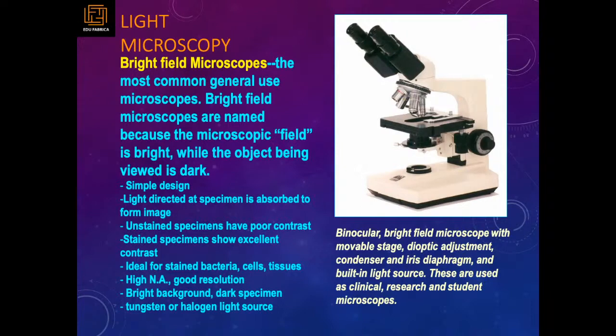So let's start with the light microscopy, that is bright field microscopy, that is mostly what we are using in the lab. Once you enter into the molecular lab or CSIR lab in India, or any big institute, IISER labs, IISc lab, IIT labs, anywhere in the big world or in some private institute, this is the microscope that you will see most commonly being used by the scientists, students, anyone. Most of the work, 80% of work, is done by this simple microscope.